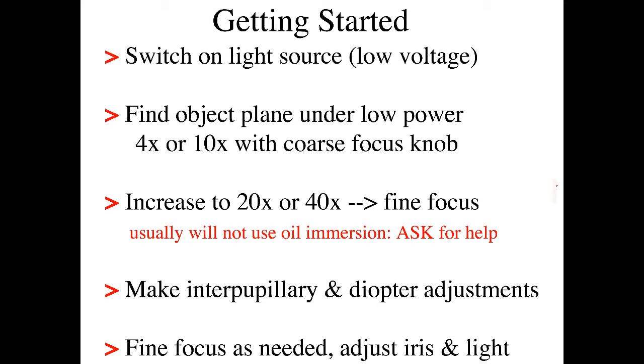Now, a word about oil immersion objectives. All of your microscopes have oil immersion objectives. You will rarely, if ever, have to use the oil immersion objective in this course. If you've not used microscopes before, please ask one of the instructors for help the first time you use your oil immersion lens.